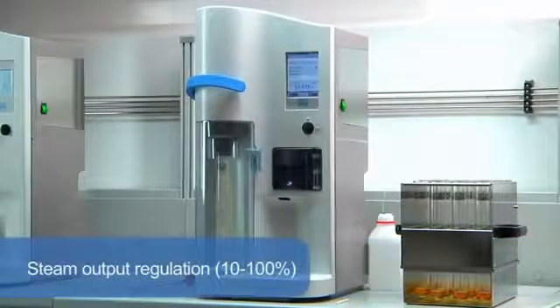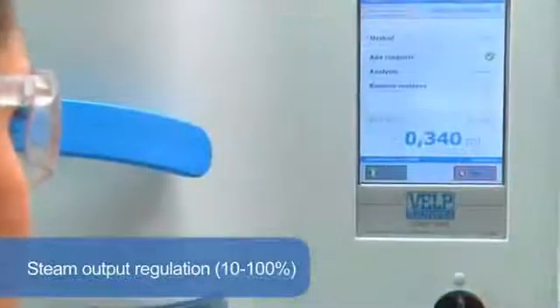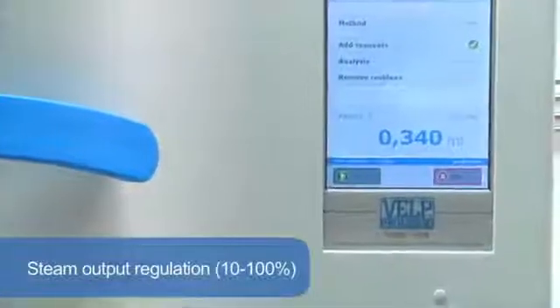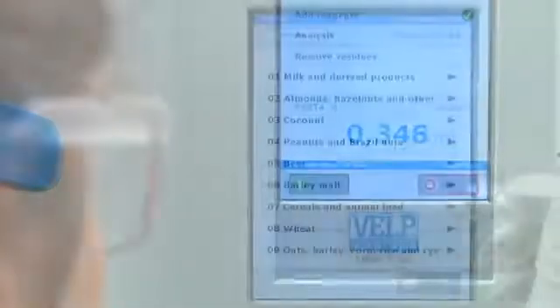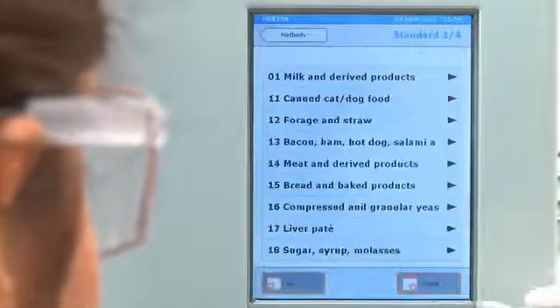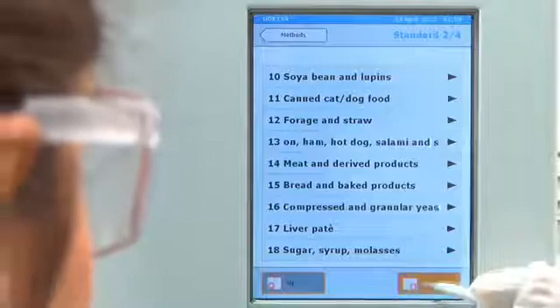Variable steam output regulation, 10-100%, enables the UDK 159 to respond to the needs of many applications, including alcohol, volatile acids, phenols, sulfites, and TVBN determination.